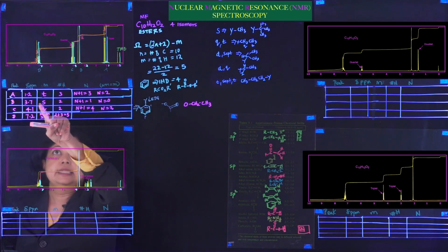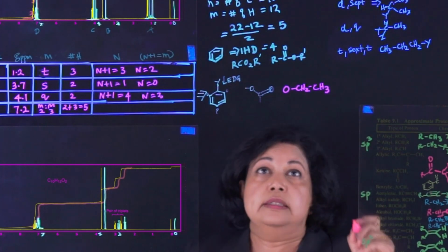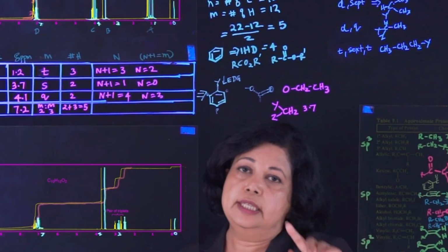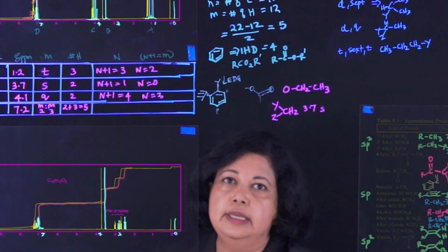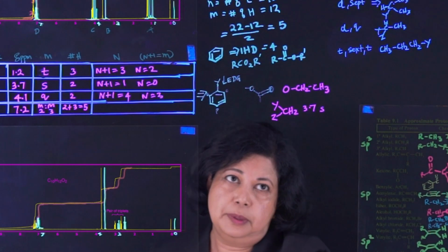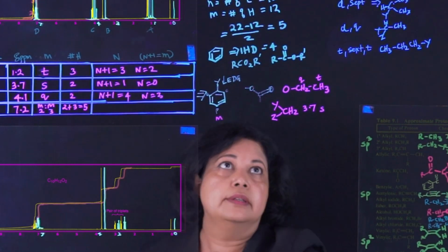Well, if you look at this, there's a singlet with 2 hydrogens. And where is it? It's on 3.7. So you have a CH2 here, and that's very deshielded at 3.7. If it is a singlet, it means these groups that are attached to it don't have hydrogens on the carbon that's immediately next to it. Okay. Now over here, this is your quartet triplet, and here's your multiplet.